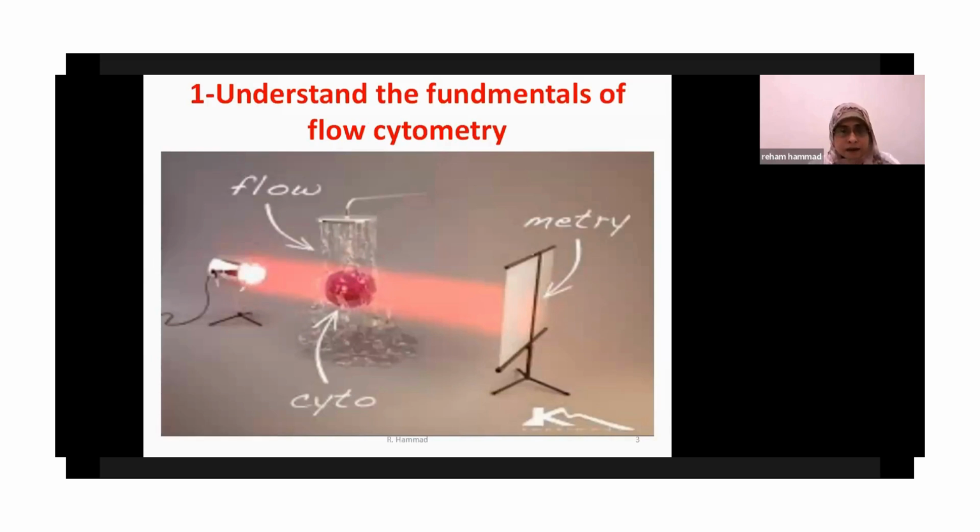Also, there is a light directed to this cell, and this light leads to scattering of the light after it hits this molecule of this cell, and then this scattered light is going to be captured and analyzed by a metry, and this is the meaning of metry.